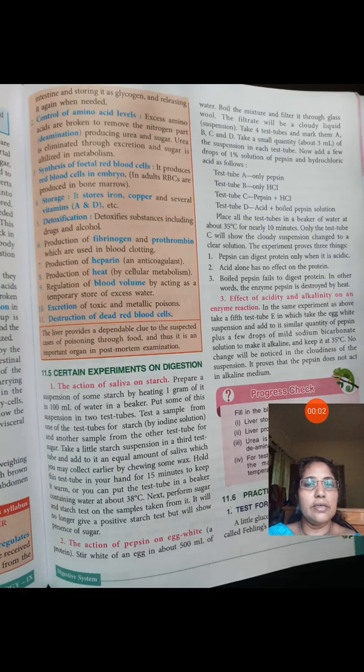Then let us see certain experiments on digestion. First, the action of saliva on starch. We can find out how saliva acts on starch by taking some starch solution. You can make it with one spoon of rice flour boiled in water.